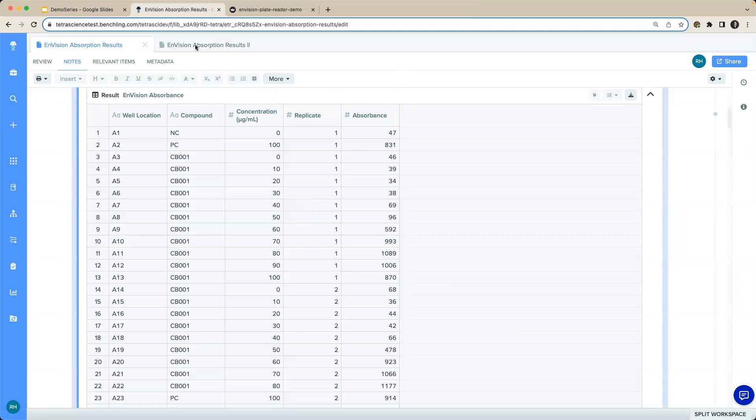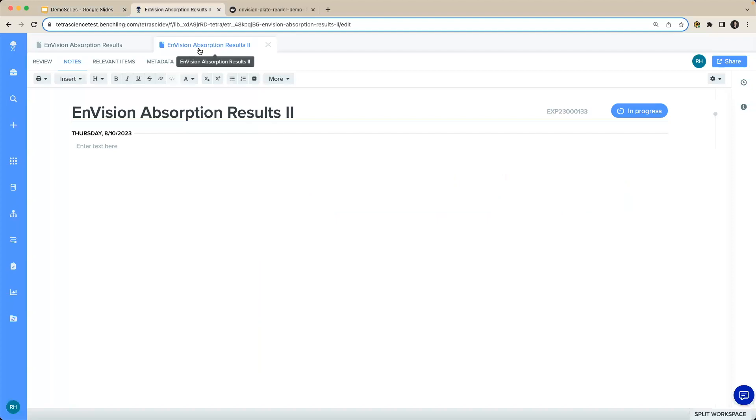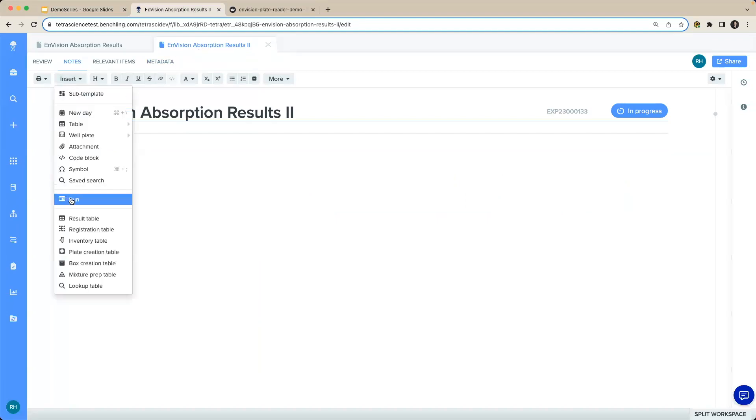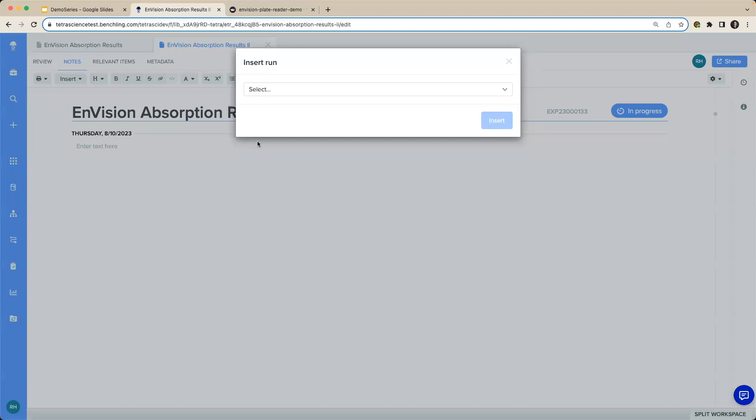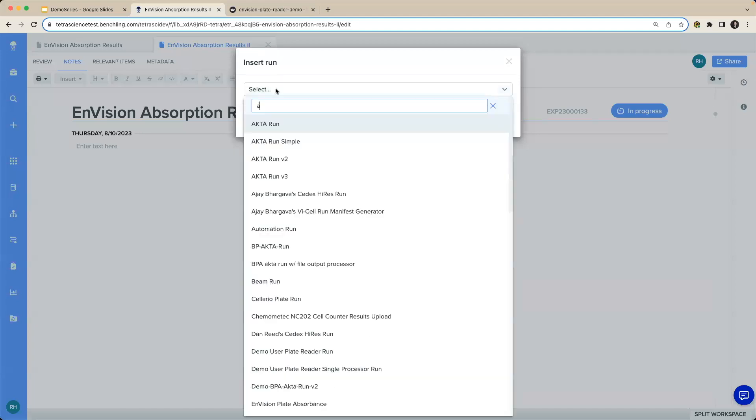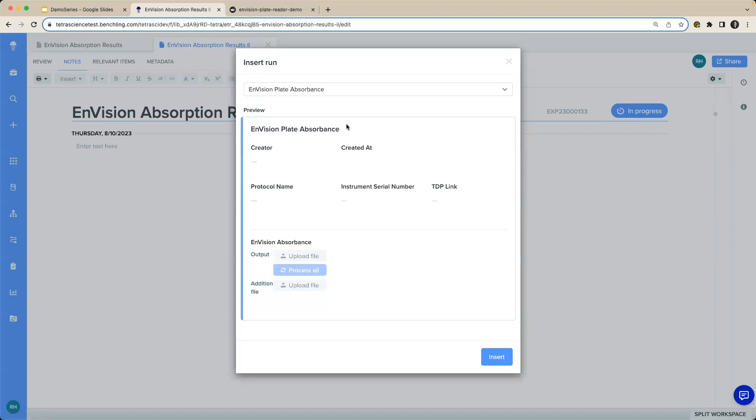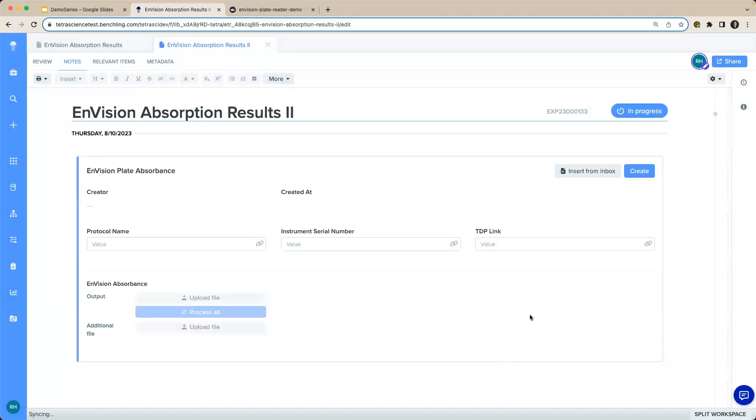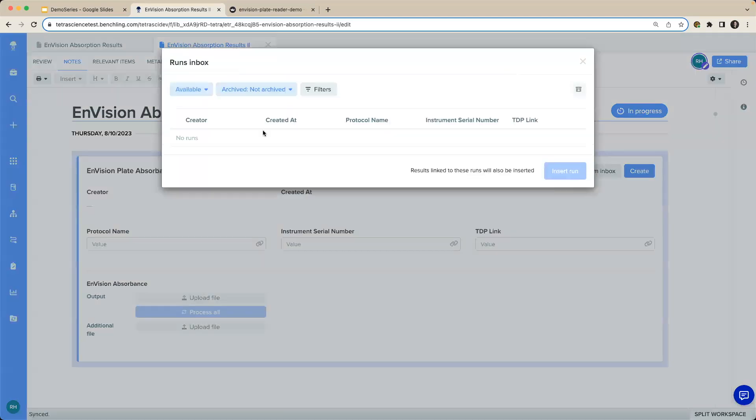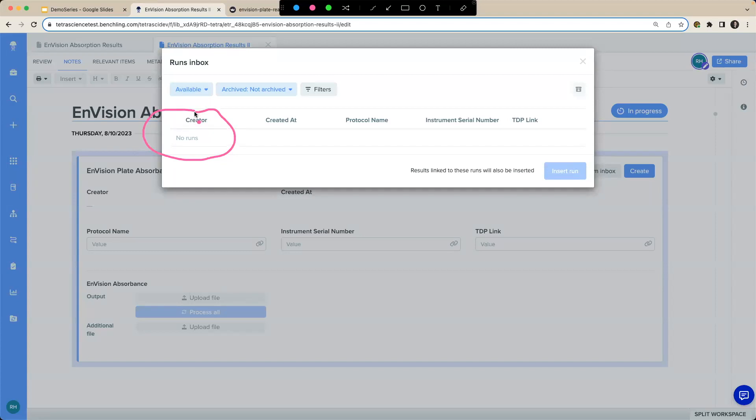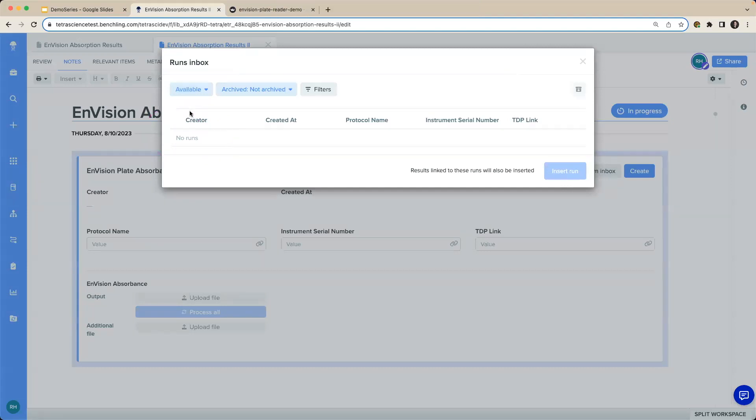And I have one other experiment here that I'll tee up for my demonstration. We'll create a new experiment. I will insert a run, and I will make another Envision plate absorbance experiment here, which I'll insert into my notebook. And I will insert some data from my inbox. Uh-oh, it looks like the inbox is currently empty, but we'll show how the platform can automatically populate that inbox.